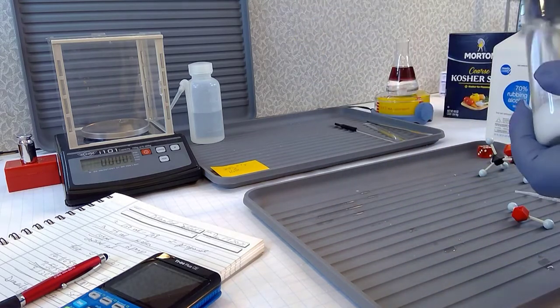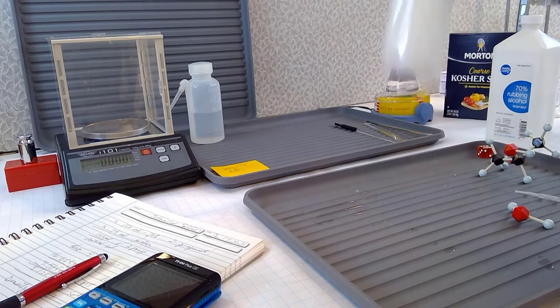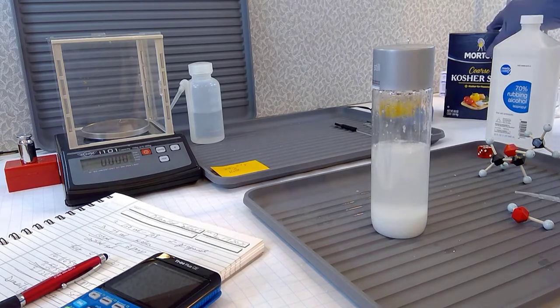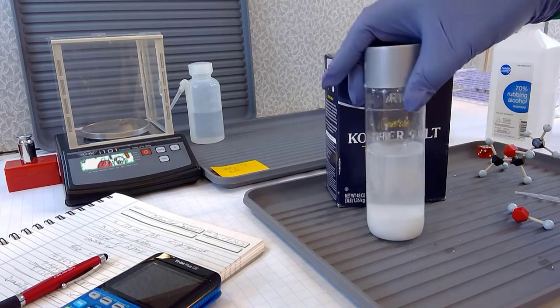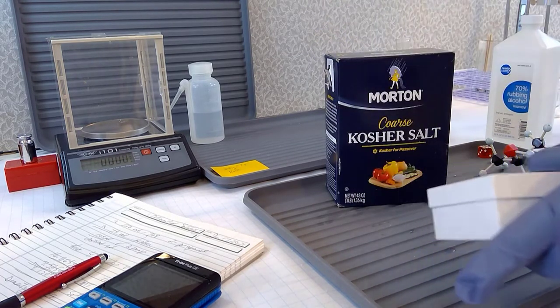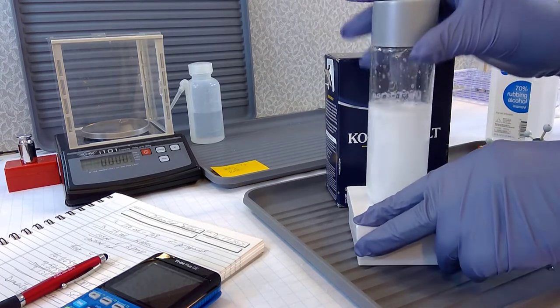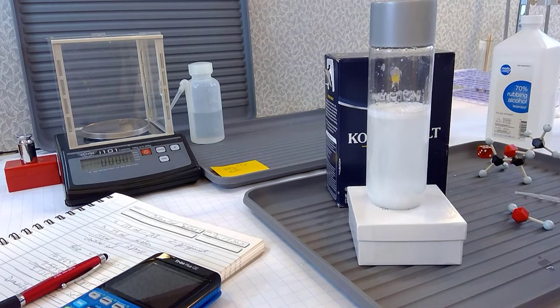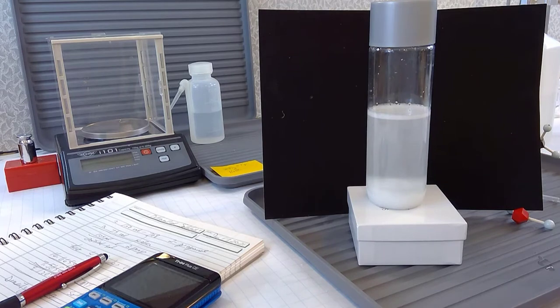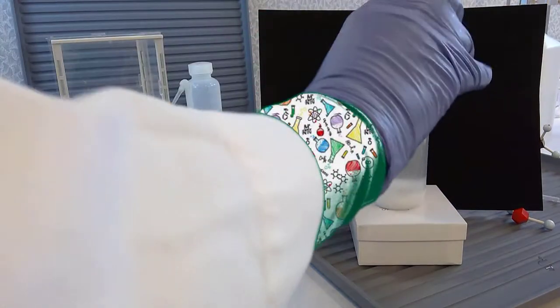And that's where the shaking comes in. I'm going to tighten this up and shake like mad, because I want as much salt to make contact with that water as possible. In fact, what I'm going to do right now is set this up so we can see what's happening. I'll shake it up some more and get a black background, increase our visibility here, and let that salt provide some competition for the miscibility that the propanol used to have.